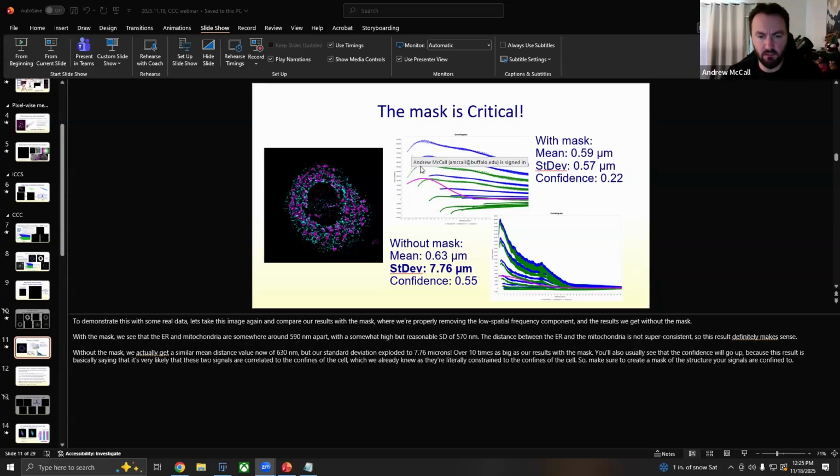So yeah, these right here are Z steps, right? And so the sample anisotropy means that there's a pretty big step down when you are looking at the cross correlation.